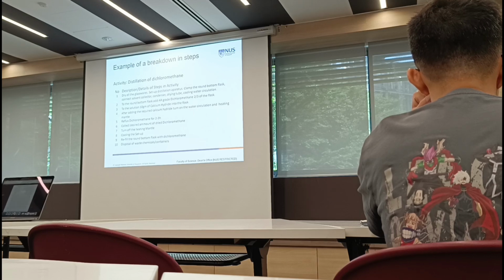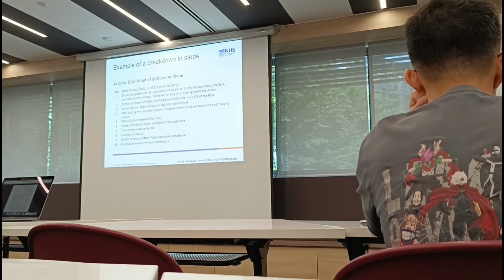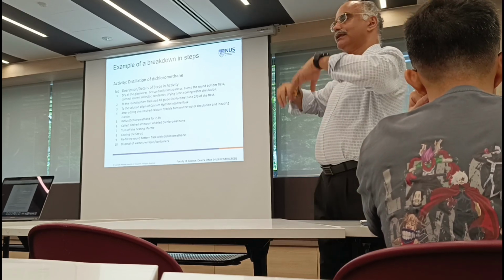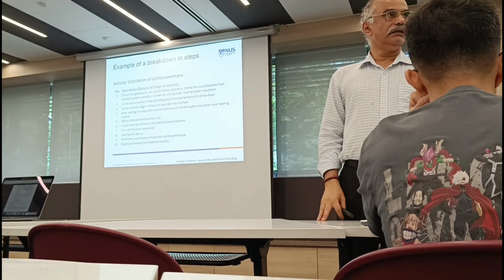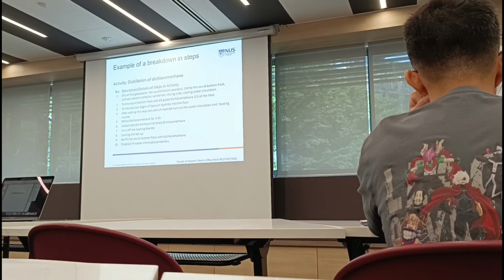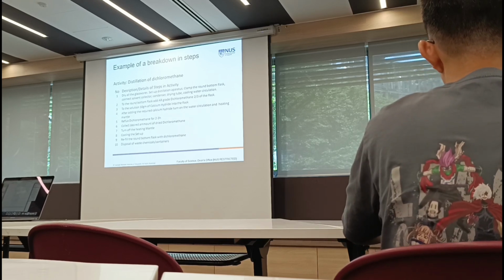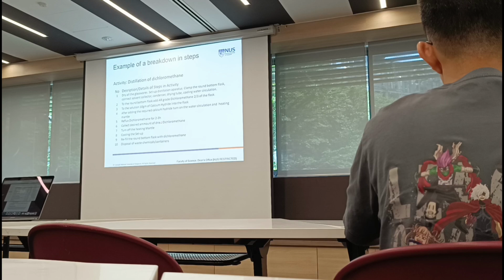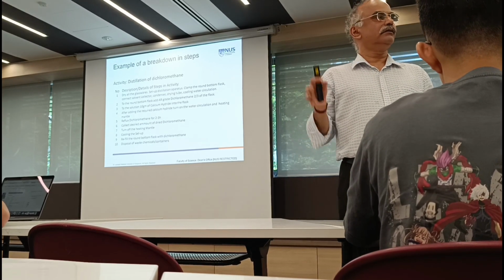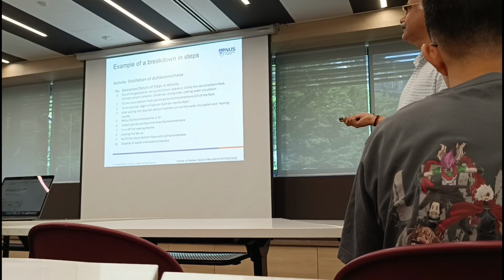And then after adding the required calcium hydride, turn on the water circulation and the heating mantle, right? So heating has to be there as well, because you have to reflux the DCM before you can dry it. And then the condenser should be set up. So here we have the condenser already, right? So water should be on, otherwise all the DCM will evaporate from the flask. Reflux dichloromethane for 2-3 hours. And again, you want to make sure that it is done safely. What other things can go wrong? Bubbling over and so on, right? All those things we need to consider.